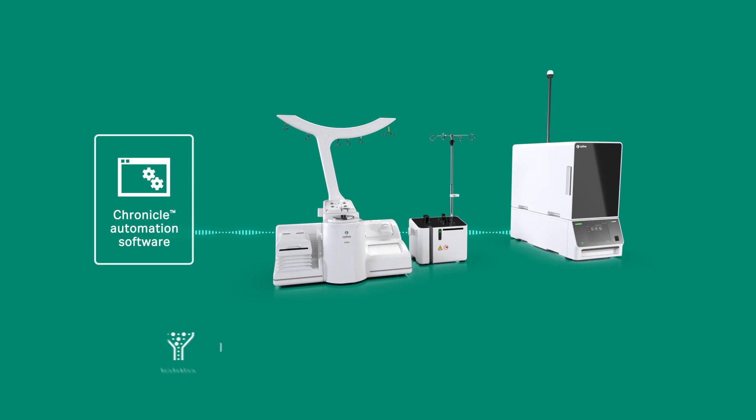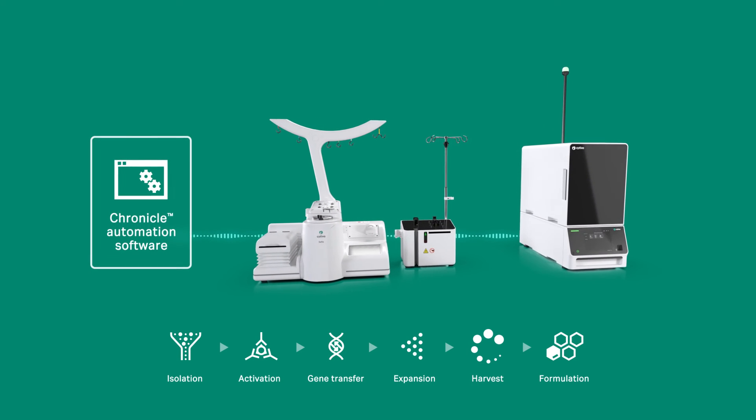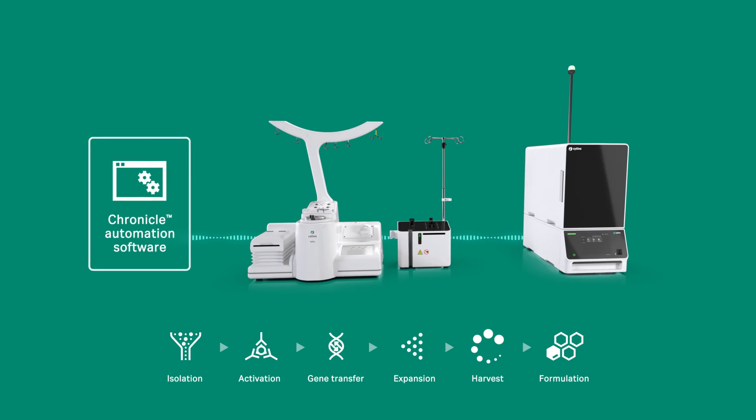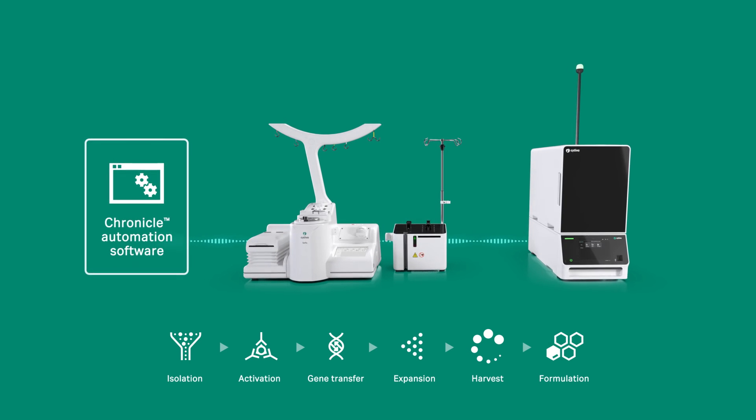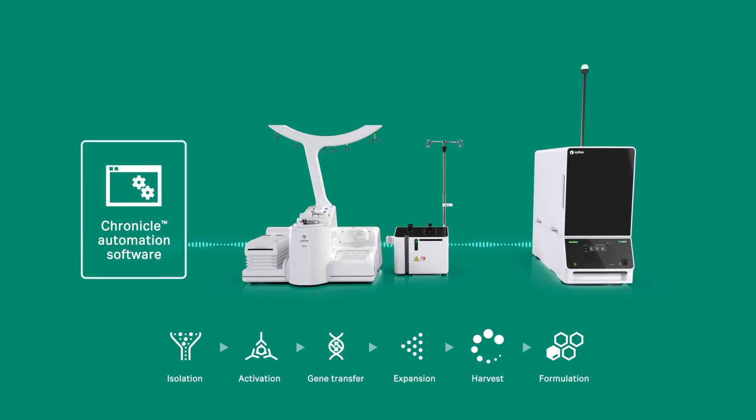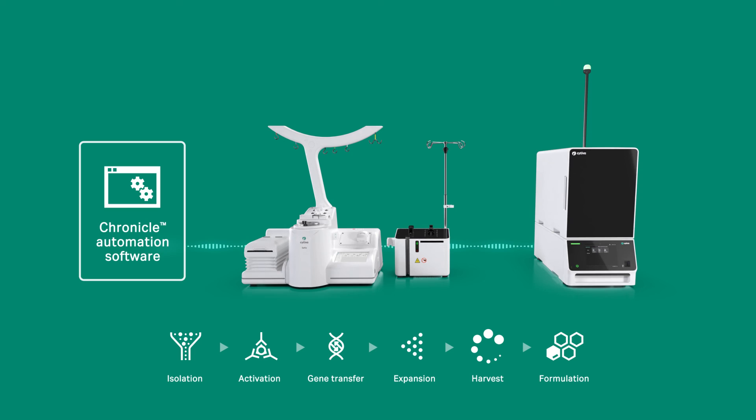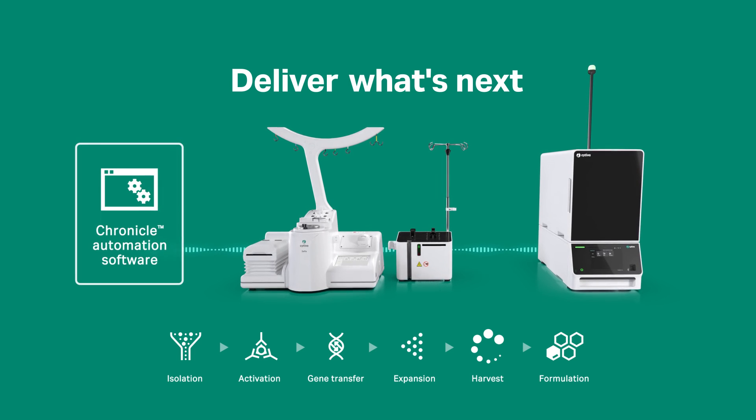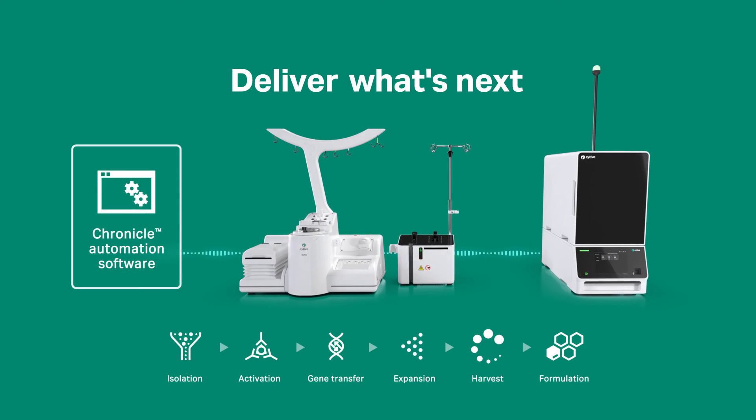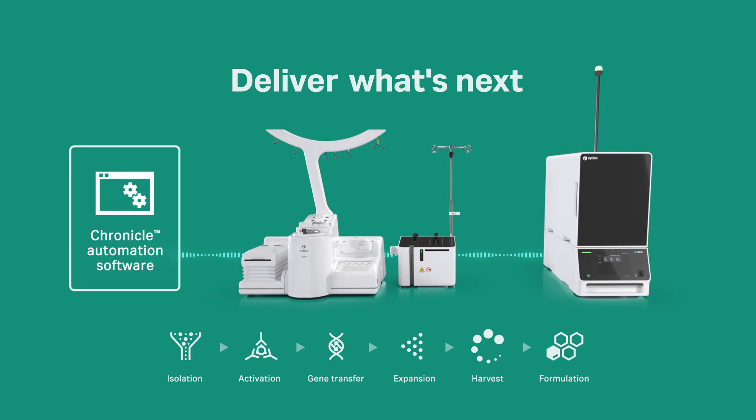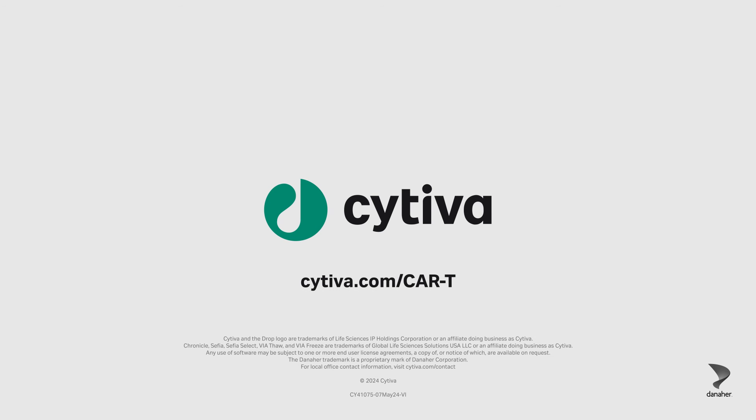Unlock the potential of a functionally closed and automated solution with Cephia Cell Therapy manufacturing platform. An end-to-end solution designed to help you deliver what's next. Contact Cephia to learn more.